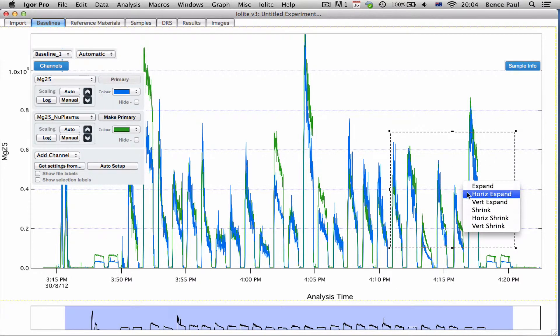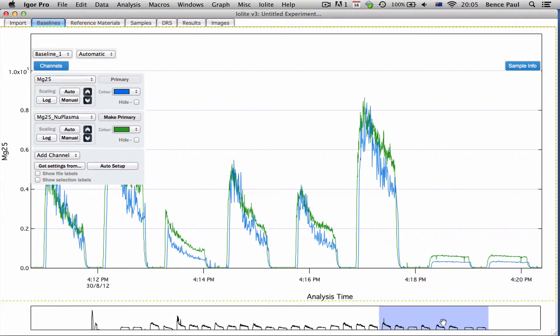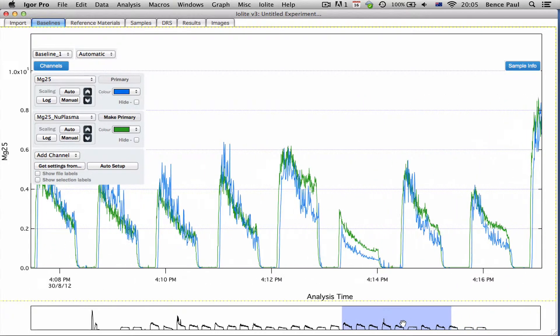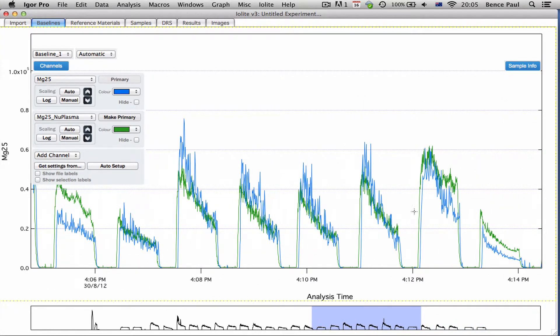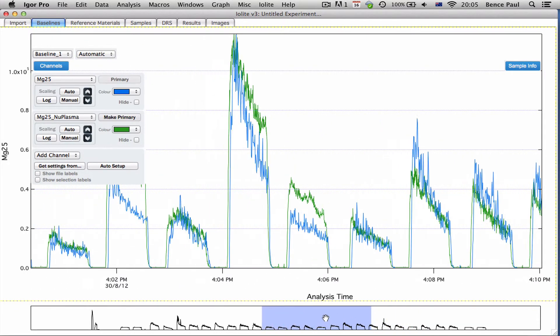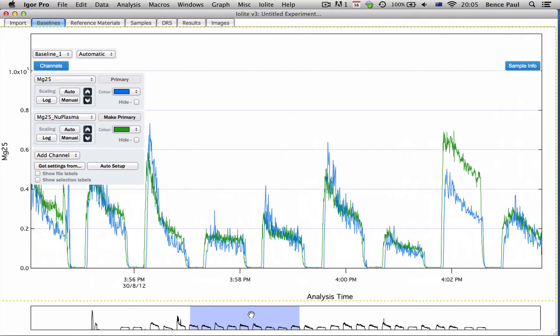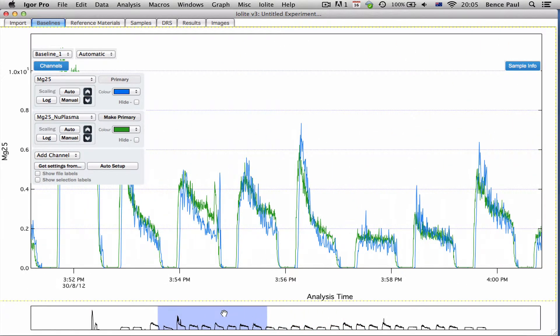There's some interesting features when you start looking at this. You can see different washout times and you can see that the quadrupole data records a lot more higher frequency variation than the Faraday's on the multi-collector. But overall you can see the same features in each of the runs as you would expect.